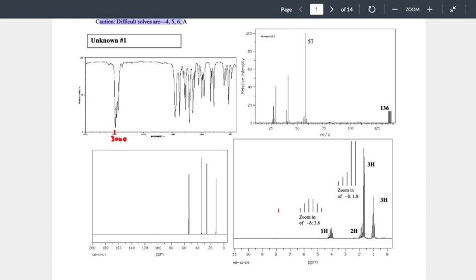Less than. As soon as I now know they're less than, I now have a bit more interpretation that I can drop on this. How many peaks are there that are less than that 3,000? There's 3. How many do I interpret? The whole group. I don't have to care about referencing each of those individual peaks.